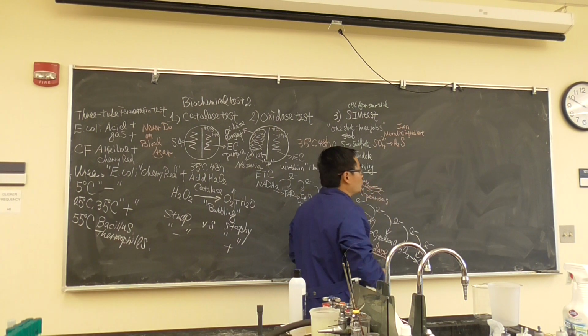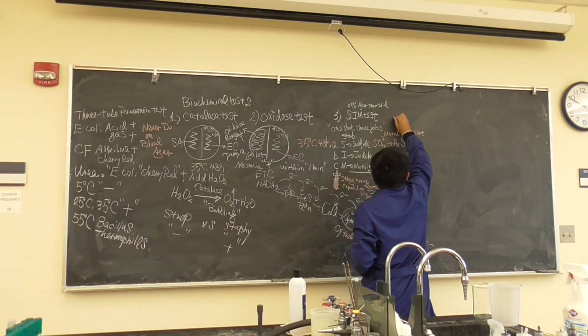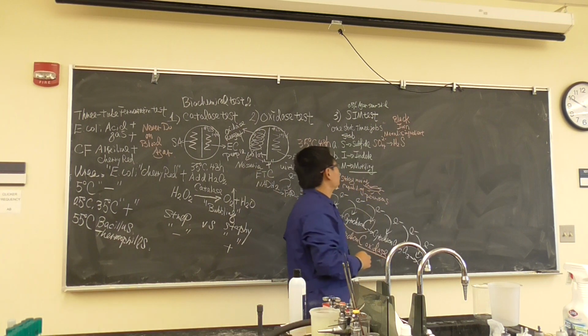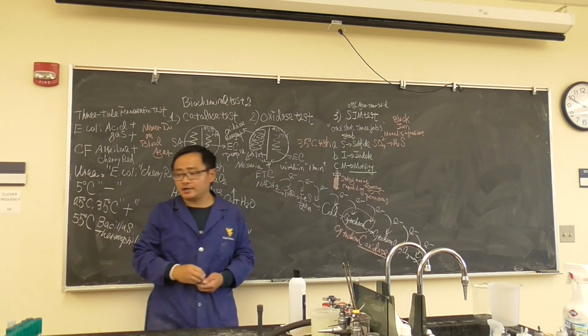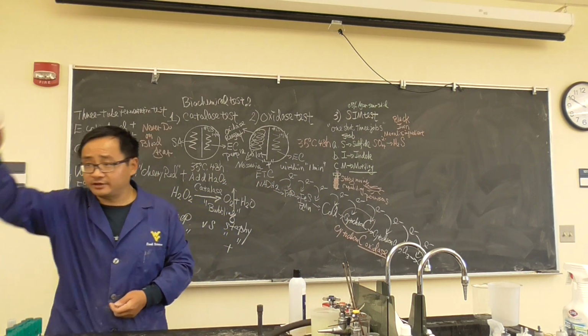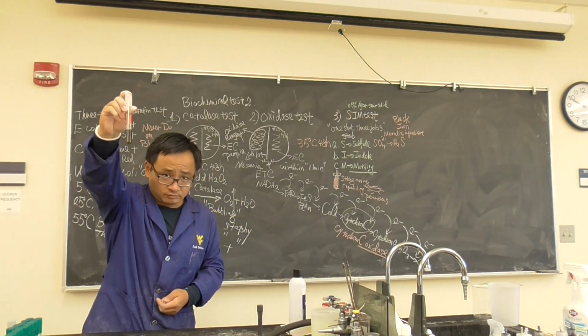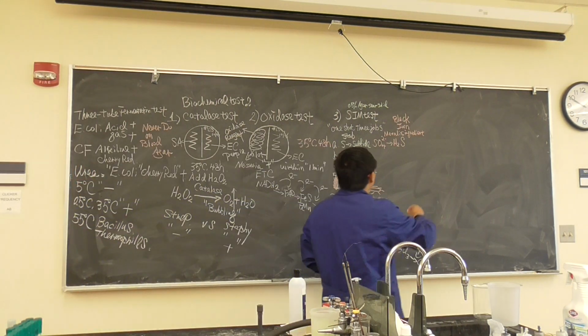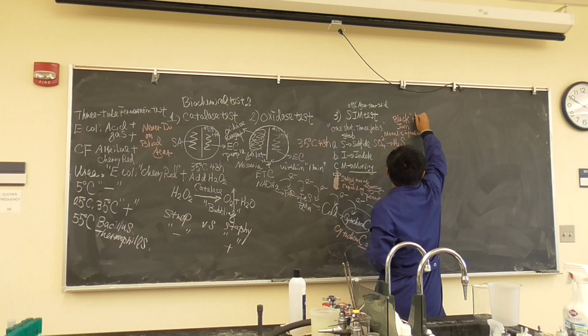And sulfide will make them turn black. So if you see the black color, somewhat like this next week, which is sulfide positive. Okay, black color, sulfide positive.